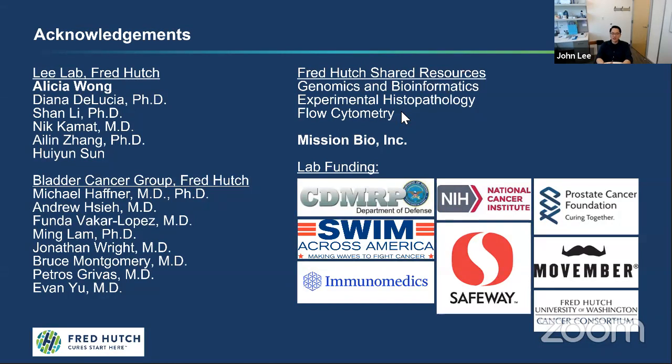We've already established that we can take these cells that are transduced with these lentiviruses that express GFP, and we can transplant them into syngeneic immune competent mice. And so the next step really is to acquire the technical skills to actually do the orthotopic injections, which is not trivial. So we have some collaboration set up to get that going.